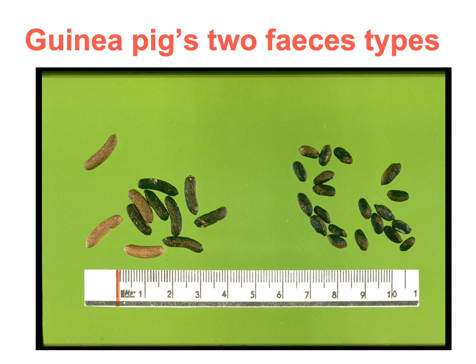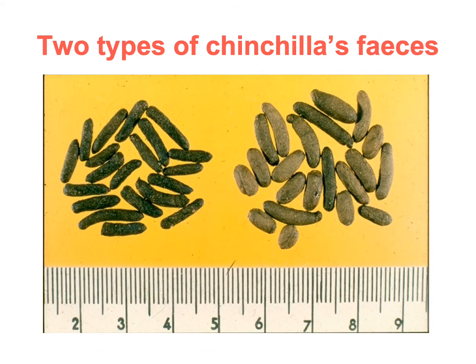The only difference from the rabbit is that the guinea pig is eating it from the bottom of the cage and not from the anus. And only to show the two types of chinchilla feces.